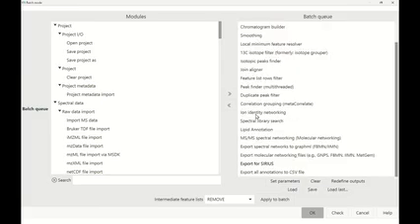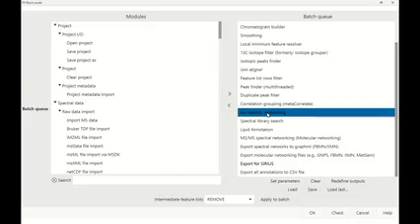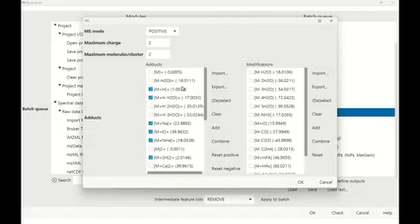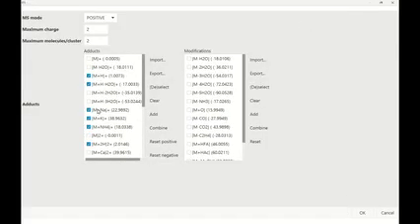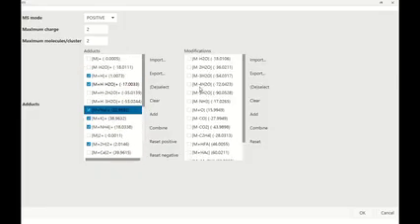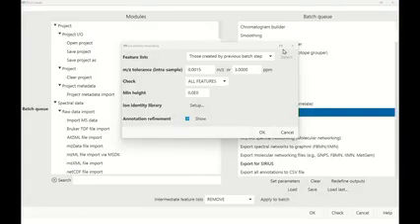And there is one step, the ion identity networking. In ion identity networking, you could just double click and there are some more parameters to set up. And there's also the ion identity library. In the ion identity library, you could then set the M plus H or M plus sodium, potassium. There are some in-source fragments that you can search for. And there are also multimers that we're searching for. So some compounds cluster together depending on the in-source conditions, and they are also going to be found here. And we can also visualize this now.